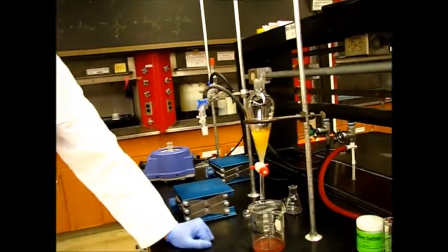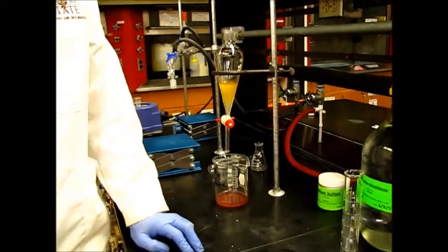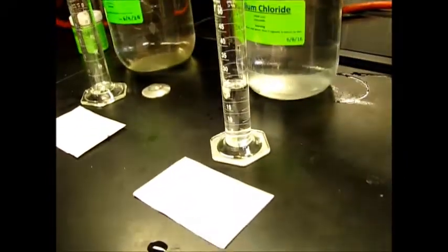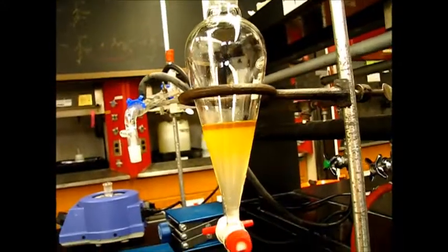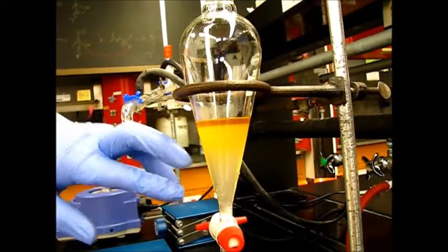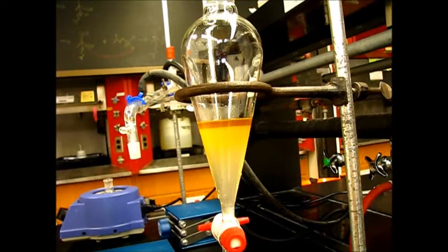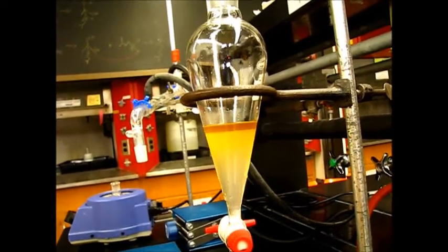So we'll wash one more time with the sodium bicarbonate. Yes. And then dry with saturated sodium chloride solution. This one is taking a bit longer to separate the layers than most. You can see the yellow is receding and this little darker band is starting to grow. We're going to wait until this bottom solution is mostly clear. It takes some more time.